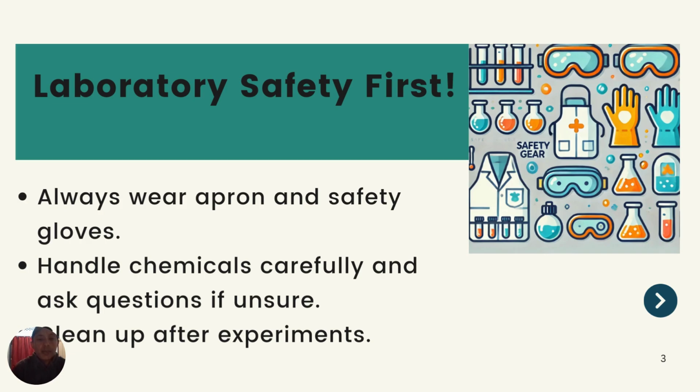So we should be very careful, dear students, and handle chemicals carefully and ask questions if you are unsure. If you do not recognize the chemical, then do not touch it by guessing. Please ask your facilitator or your teacher there. Also, clean up after our experiment work is completed. This reflects our discipline, if we clean up the materials after experiments and keep them in place.